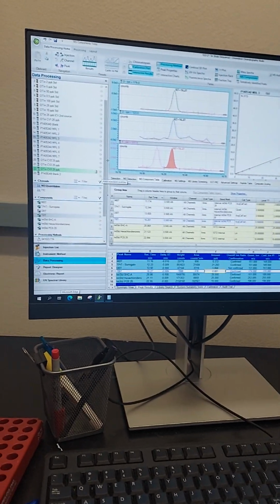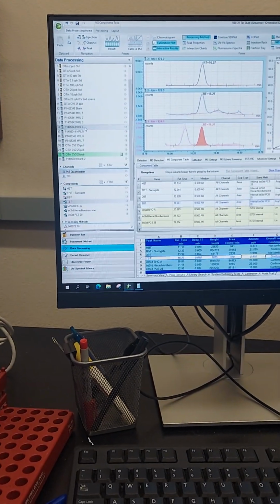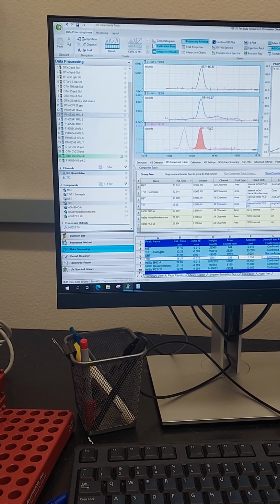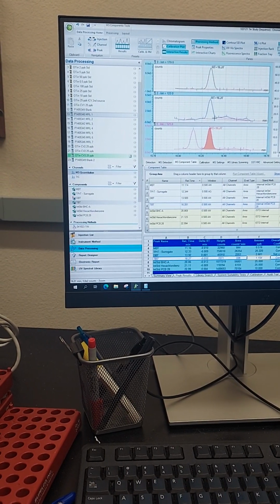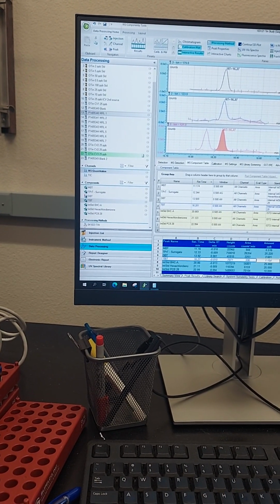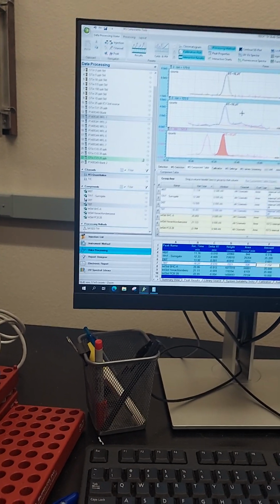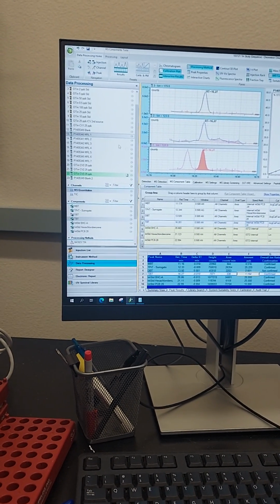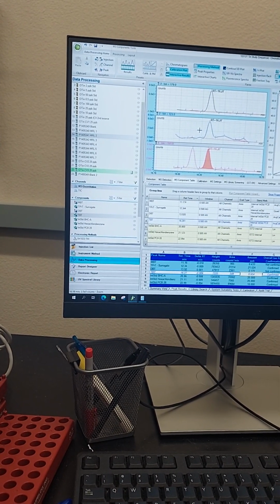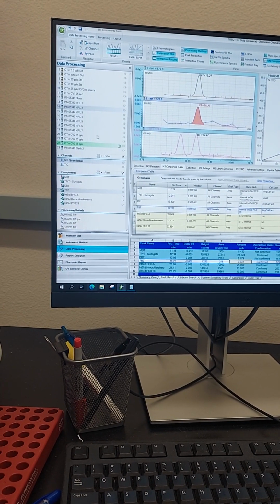Back to the data. If you have more, you need to repeat the same for each image. So like this one, I mean, you could manually integrate it. You probably should, but it's already confirmed. So kinda, I mean, you should do it. So this one actually looks fine, and it confirms, so it's fine.